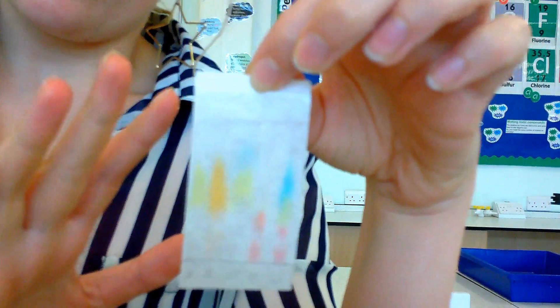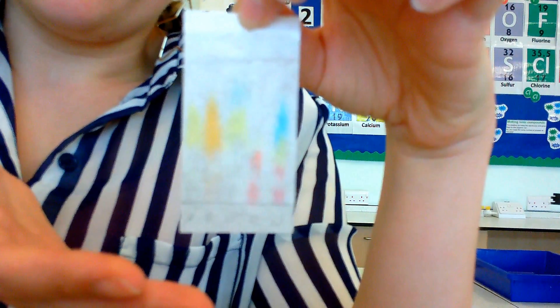But you can also do it a bit more precisely, a bit more scientifically, and calculate our RF values. For an RF value, you need the distance between the pencil line and the top of your solvent front, and the distance between your pencil line and your spot - the middle of your spot. To calculate your RF value, it is the spot distance divided by your total distance. We then do it for all of our spots, compare the RF values of U to the rest of them, and whichever have got the closest RF values, that must be the matching dye.